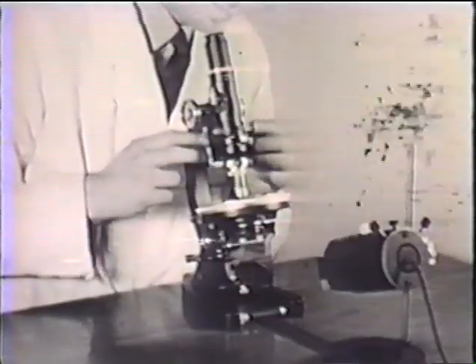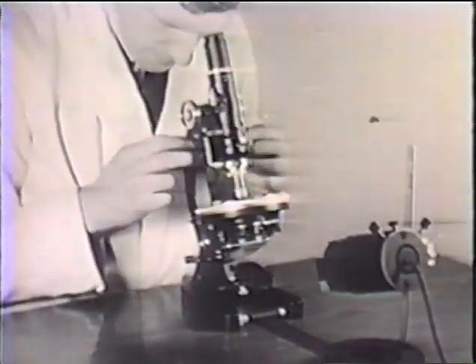We will now consider the use of the analyzer. When we insert it the field becomes dark. On turning the polarizer the field brightens. But it is usual to keep it at right angles. Many objects give brilliant effects when examined in this way.